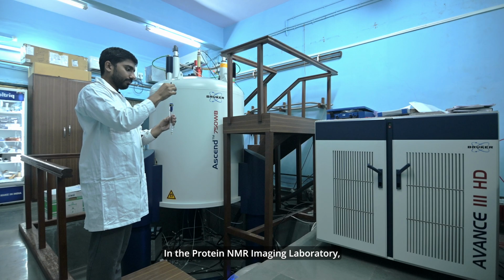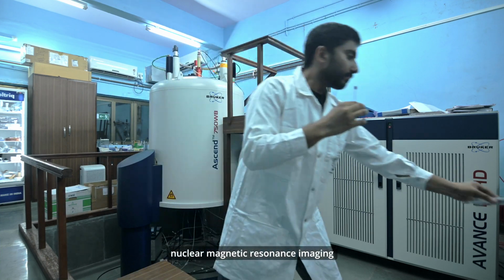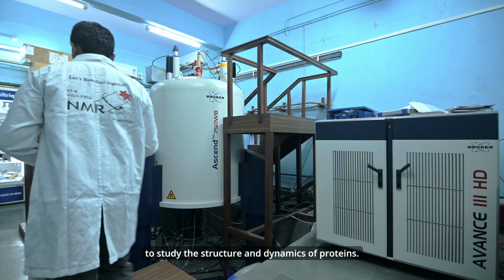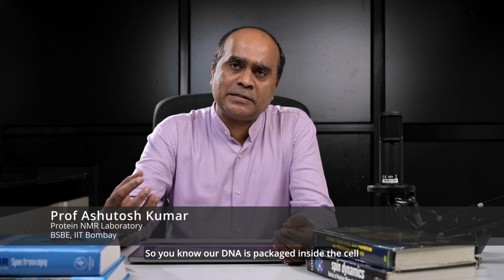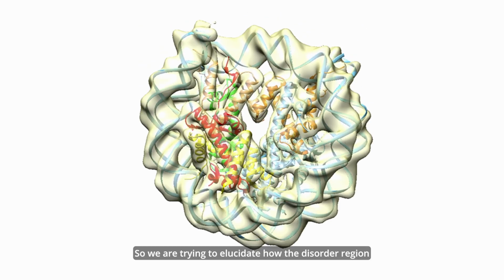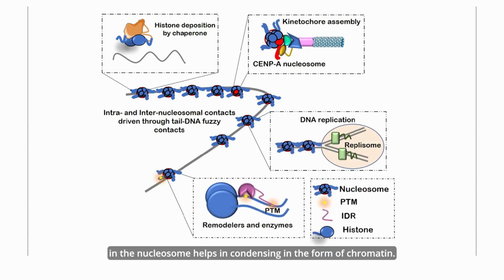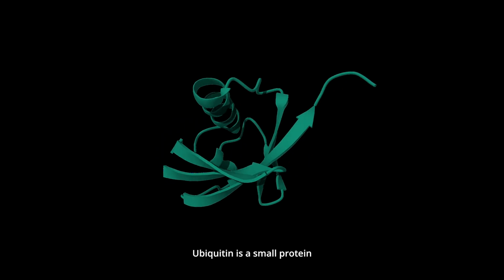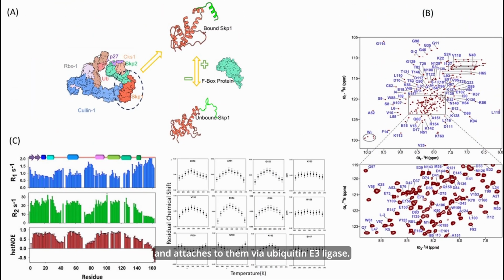In the Protein NMR Imaging Laboratory, Professor Ashutosh Kumar uses nuclear magnetic resonance imaging to study the structure and dynamics of proteins. We are looking at the nucleosome dynamics. Our DNA is packaged inside the cell by this tiny machinery called nucleosome. So we are trying to elucidate how the disordered region in the nucleosome helps in condensing in the form of chromatin.